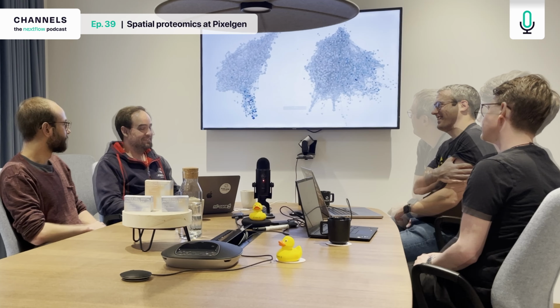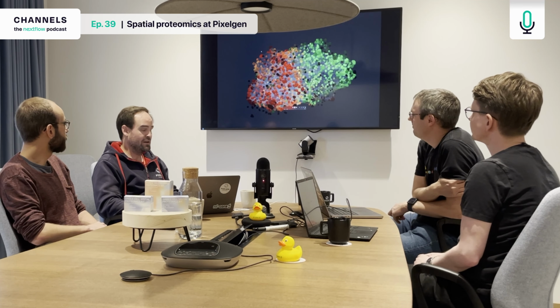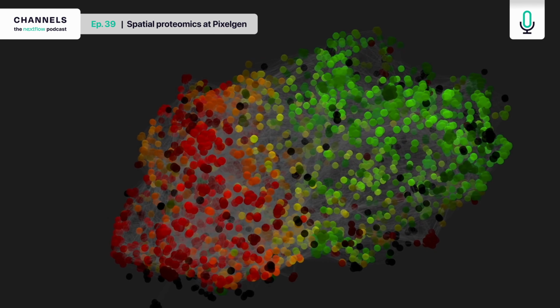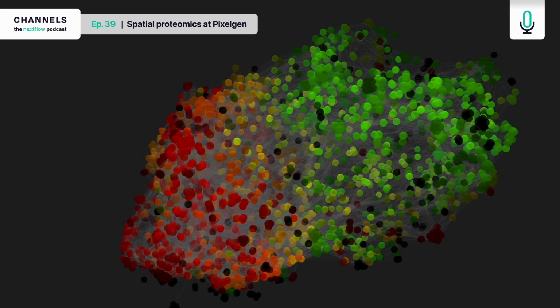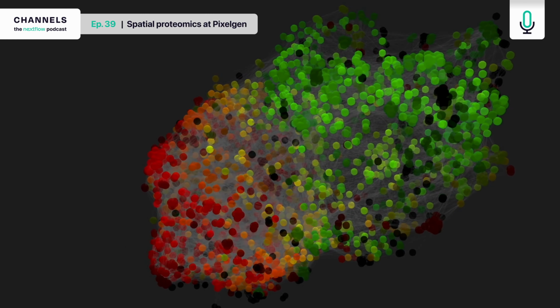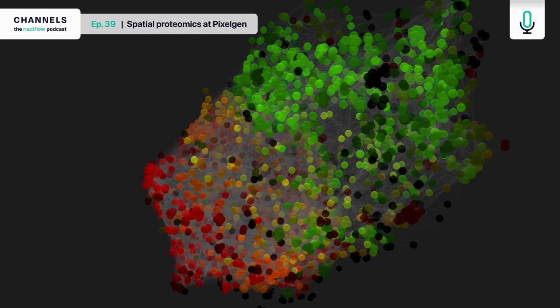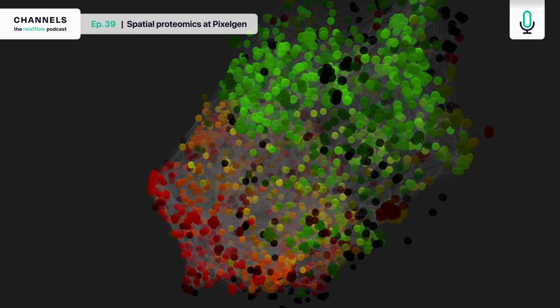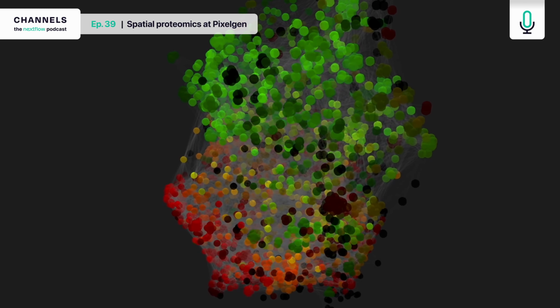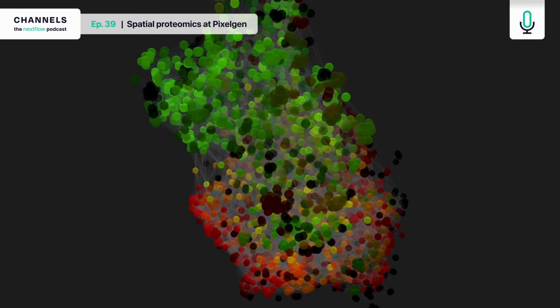So cool. Amazing. This other video is telling a different story. So obviously this is more about the application of how cells interact, and by random chance, some cells when you run the assay will be interacting, and we can discover those actually in our data. In this case, in red is a B cell, and in green is a T cell, and they look actually like kissing each other. So they are in close interaction, and that's really cool to see also, because we hope that will facilitate certain types of studies.